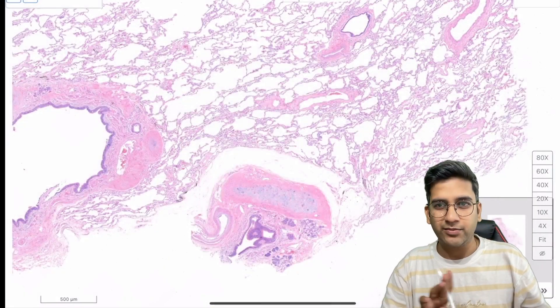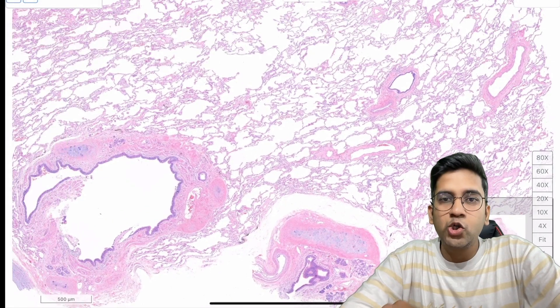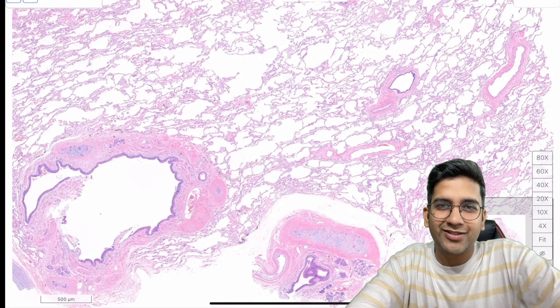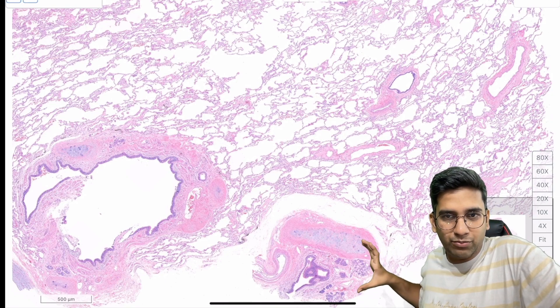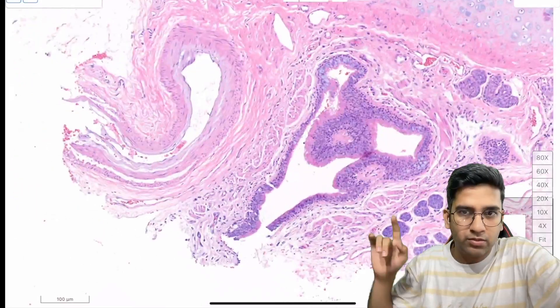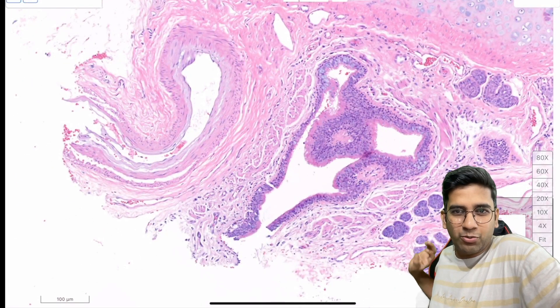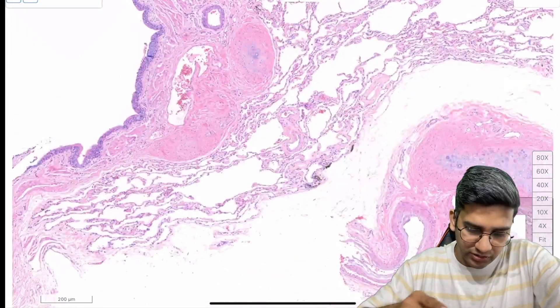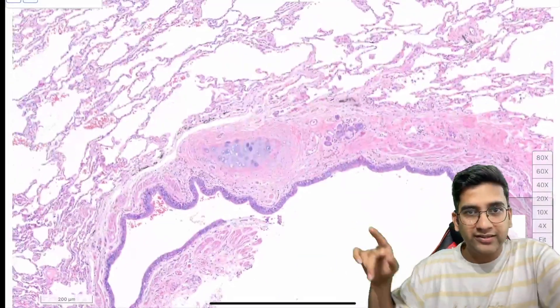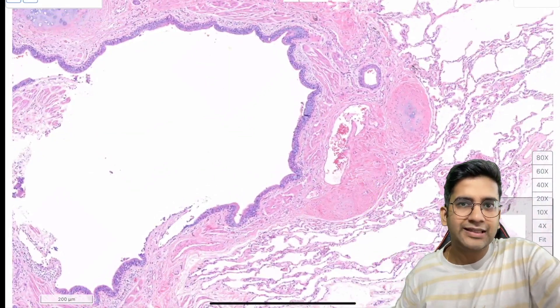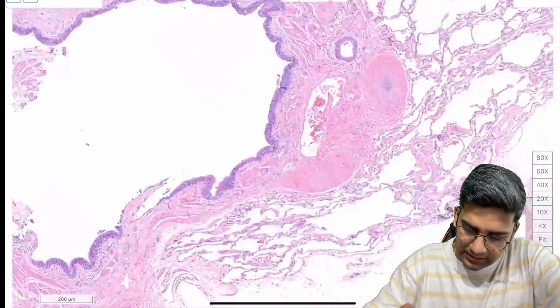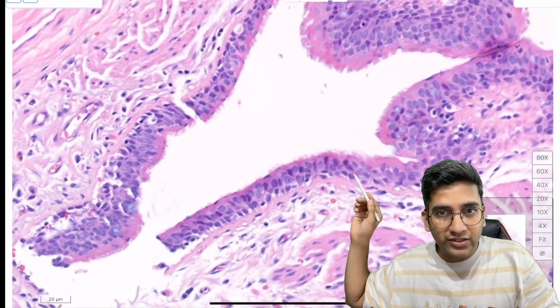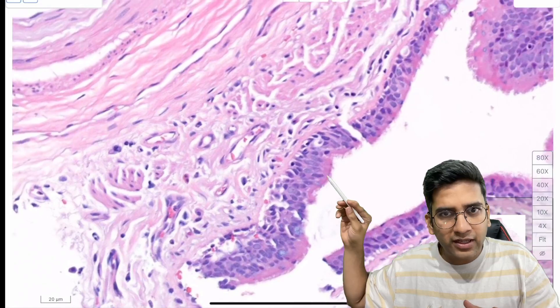Let's go to our slides and see what we can identify. Here's a perfect normal lung biopsy histology. You can see a bronchovascular bundle — the bronchus, the smooth muscle, the bronchial glands, the cartilage, and the vessel are all bundled together. Looking at this bigger bronchus, you can see a cartilage cross-section and definitely a vessel — a perfect bronchovascular bundle.